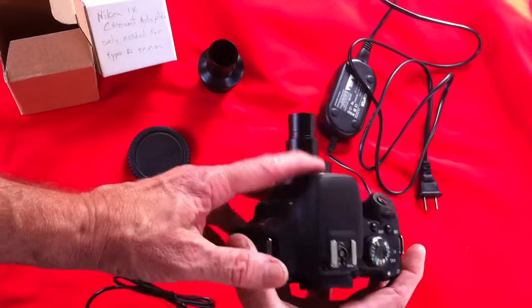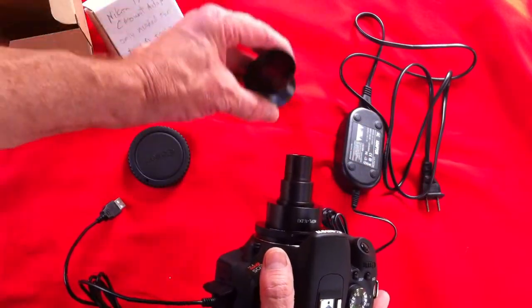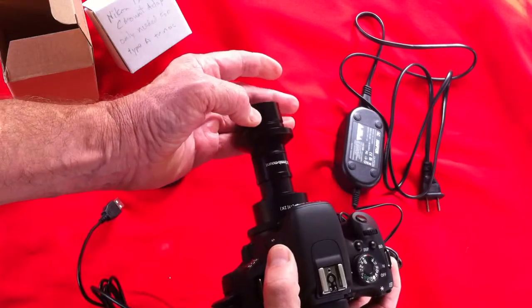On some microscopes we're ready to slip this into the photo port. On other microscopes we'll have a C-mount, and it'll drop into the C-mount like that.